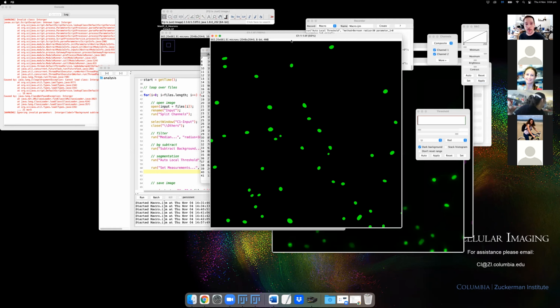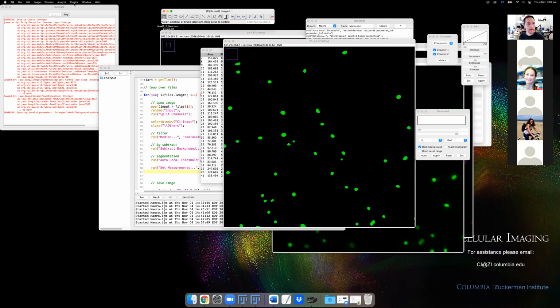And then one more that's actually quite useful for this. You can say In situ show, this will actually overwrite this image with the results. And the one that's useful is this count masks. This will give every single cell its own intensity. And that's really useful. So then you can start to say, if we're doing more complex analysis, maybe we want to know how many spots were inside the nucleus. FISH analysis would be a really good one. If you're doing FISH analysis, you want to be able to say, okay, there were 5 spots in this cell, 6 in the other cell.